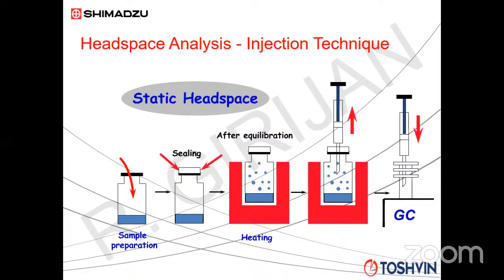I can give a very simple example for you to understand. It's a forensic application: alcohol in blood. People consume alcohol, and after some time, it comes into the bloodstream. If you take out a small quantity of blood, like 1 ml, blood is a biological liquid, a totally non-volatile sample, serum, plasma, all those.